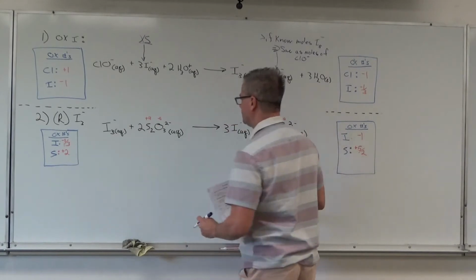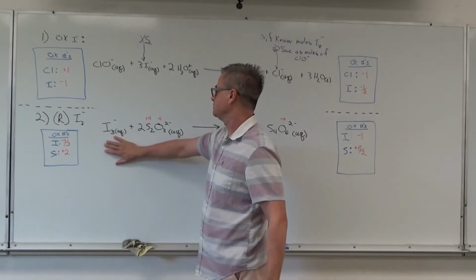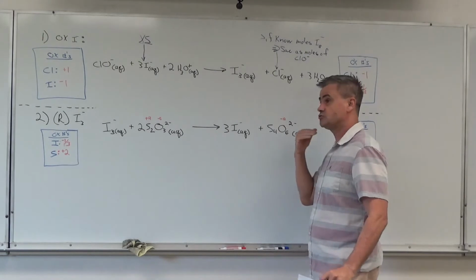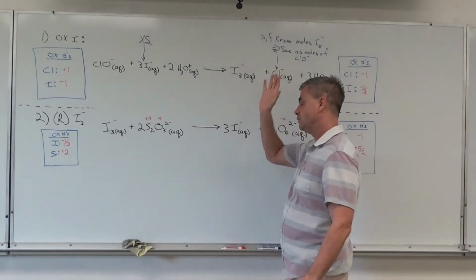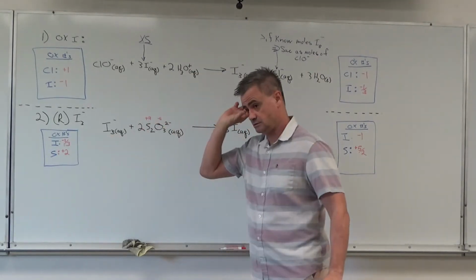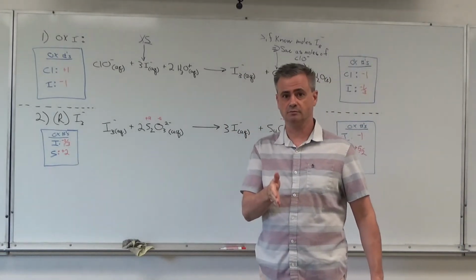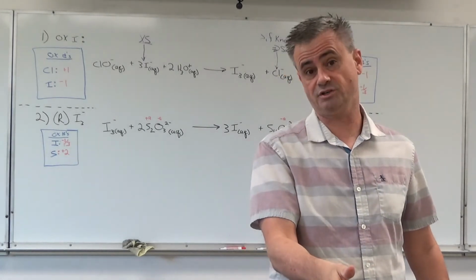Now, as this process happens, remember triiodide is going to be a brown solution. It will become clear, and you could almost try to do it by just monitoring when it goes clear, then we know that's the point that this is all gone. Okay, we can do the math and figure out how much we create. It's not what we call a sharp endpoint. It's a difficult one to call. Oh, okay, that's the point where it changed.